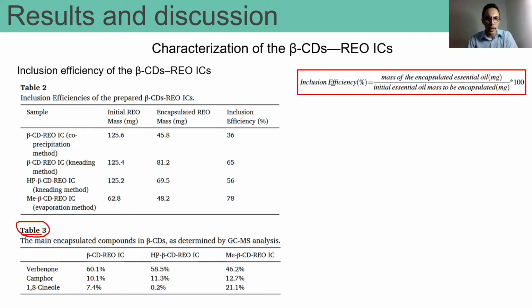In Table 3 we have the compounds that were found encapsulated, identified by GC-MS analysis.